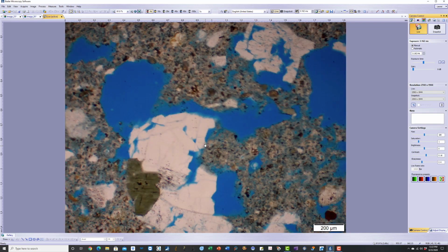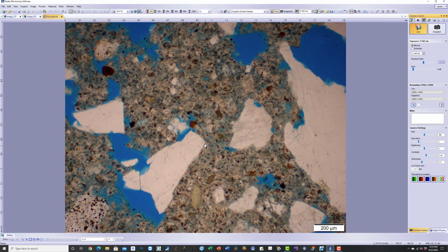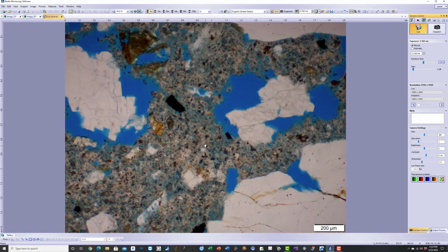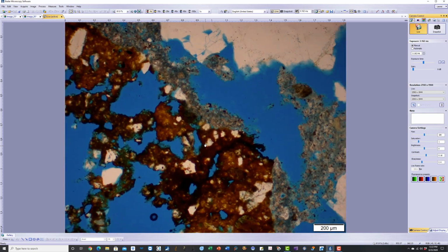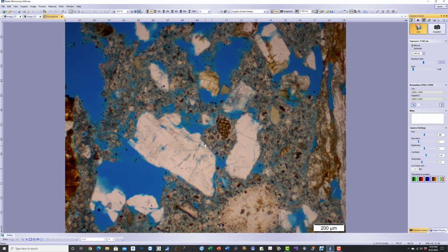I'm traversing through the concrete portion now, from the top of the thin section to the bottom, which is about 3-inch long thin section. So about the top 3 inch of the concrete is examined in this thin section. There is a residual cement particle with the belite clusters and the residual interstitial dark brown ferrite phase.